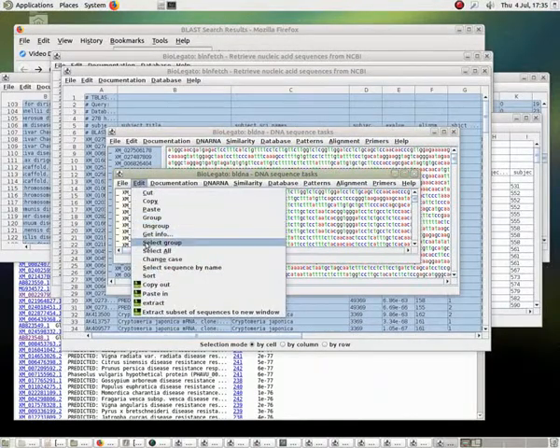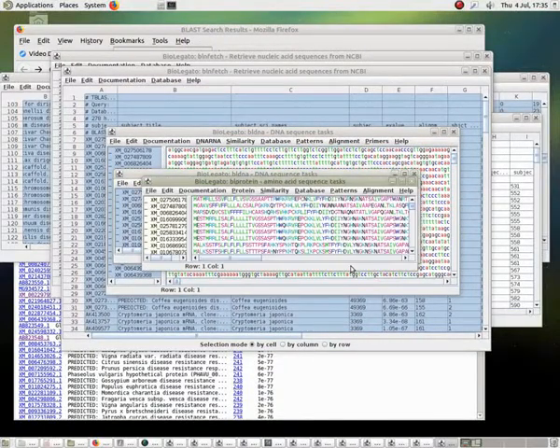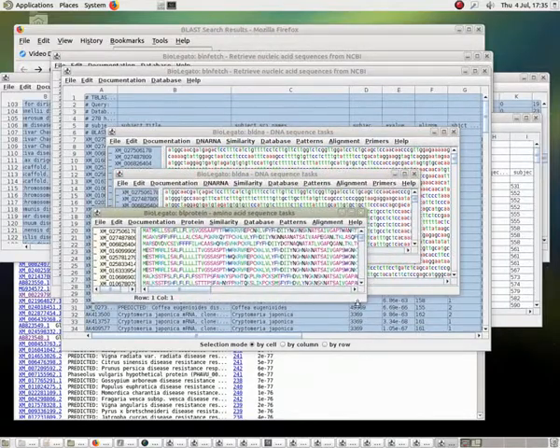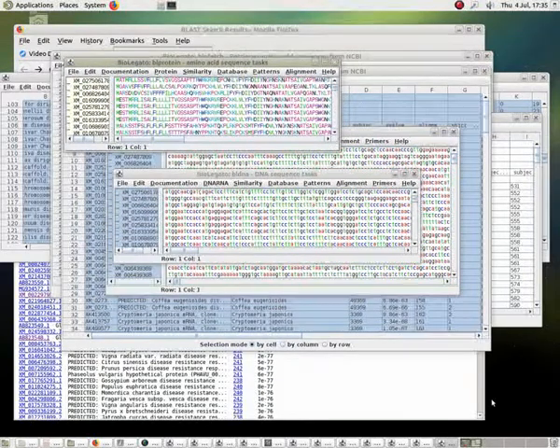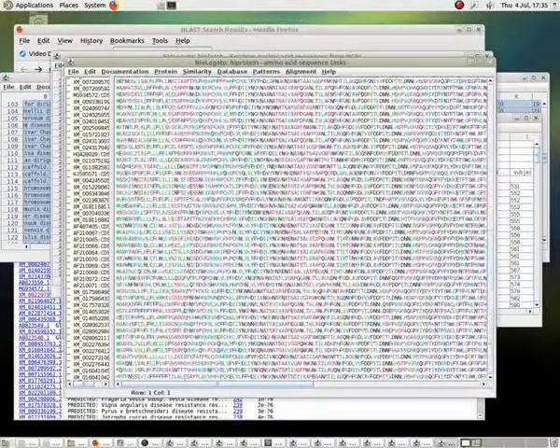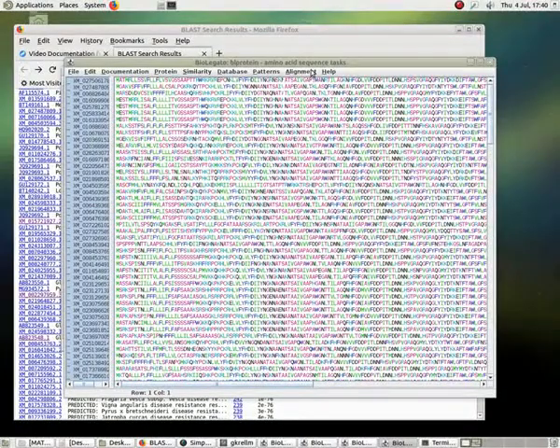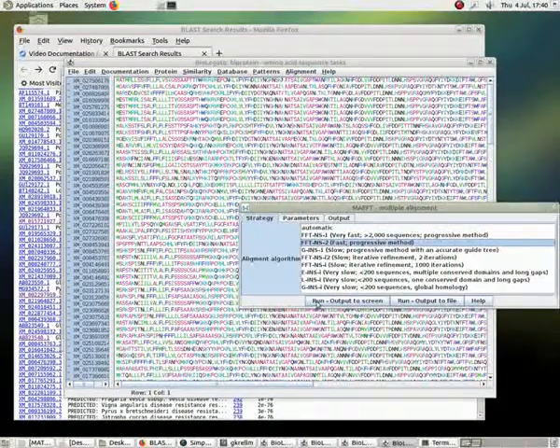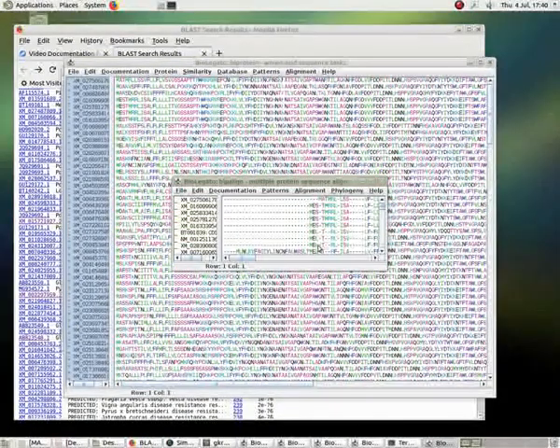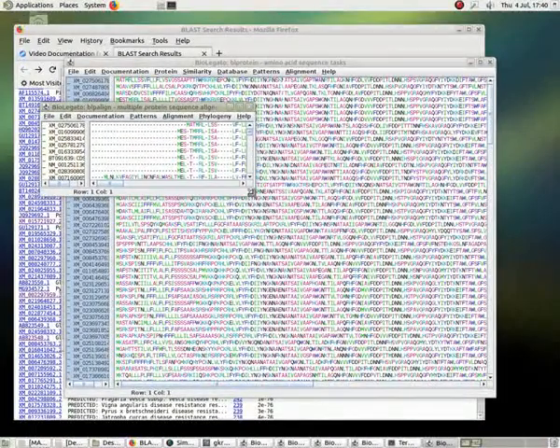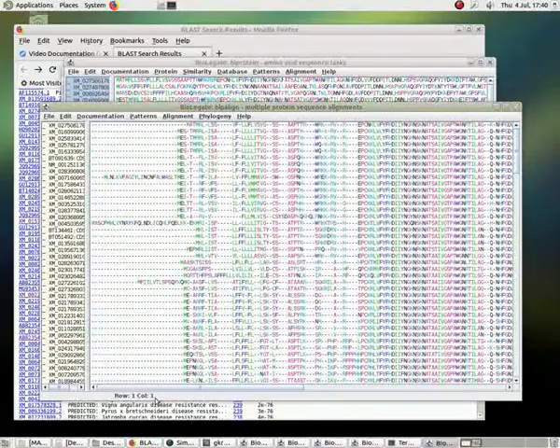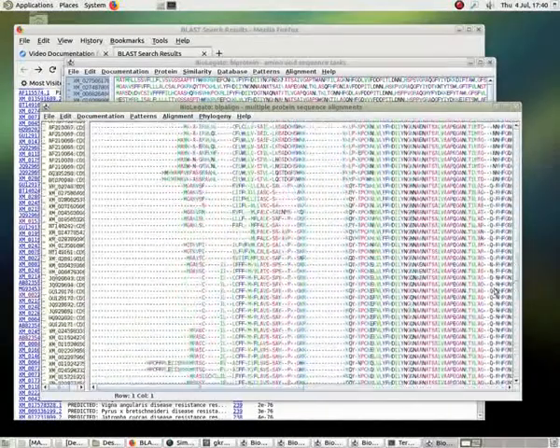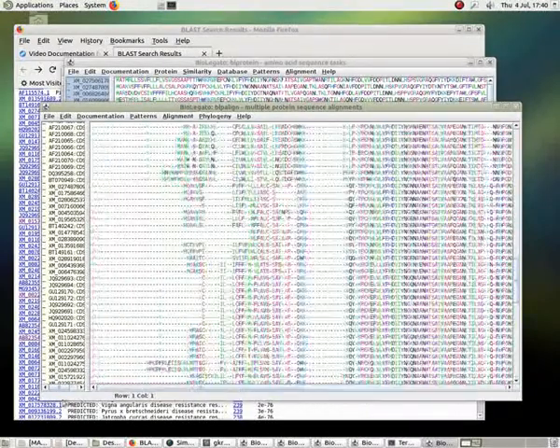If I want the proteins, I'm going to select all and then run ribosome to translate them. The output will go to a new BL protein window this time. We have a lot of sequences here, probably over 200 sequences. So you have the ability to work with a large number of sequences at any given time. Let's run MAFT and we'll do a fast progressive alignment using MAFT. There's our alignment popping up almost right away. This is a multiple sequence alignment. You can see a lot of polymorphism at the end terminus of the proteins and then a conserved core inside.